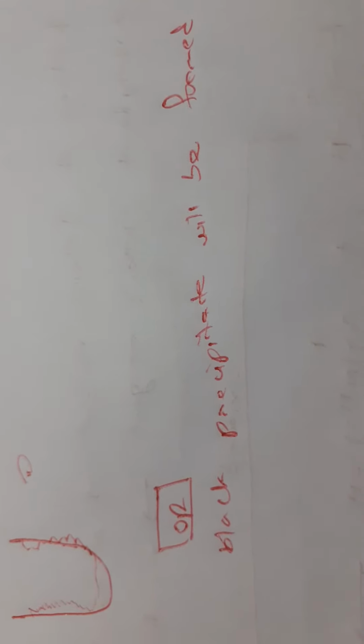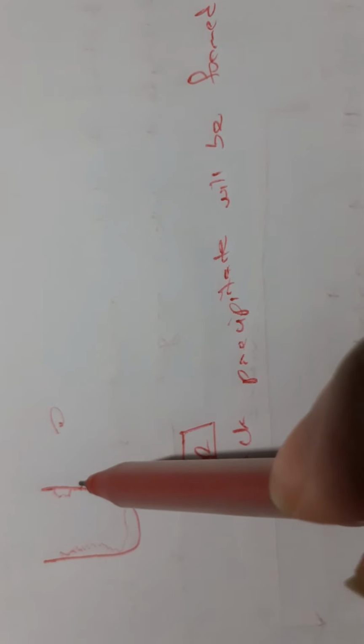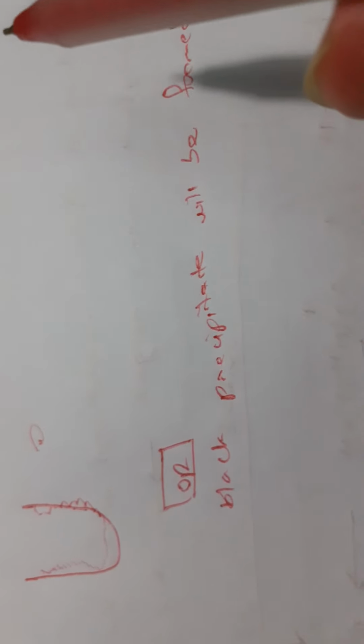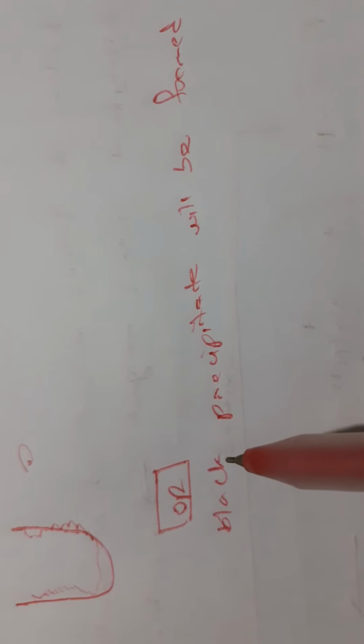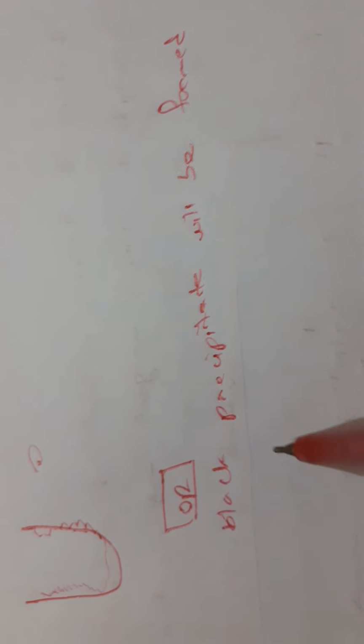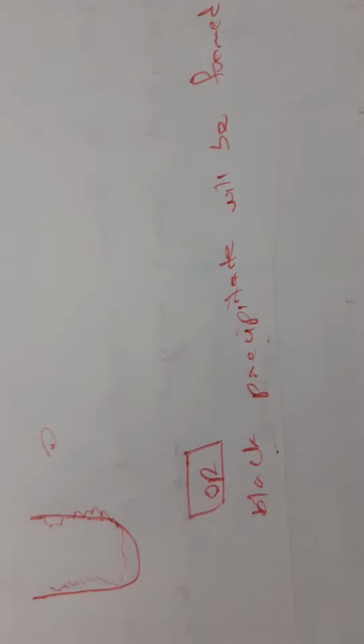Now, this test requires a lot of precision, and many first timers do not get that perfect mirror that they were expecting. So, don't get worried. At the end of the reaction, if there is an aldehyde present and you don't get that mirror, you will still see black precipitates of solid silver after some time. That will also prove that an aldehyde is present. And on the other hand, with ketones, there will be no reaction and the solution will stay as it was, colorless.